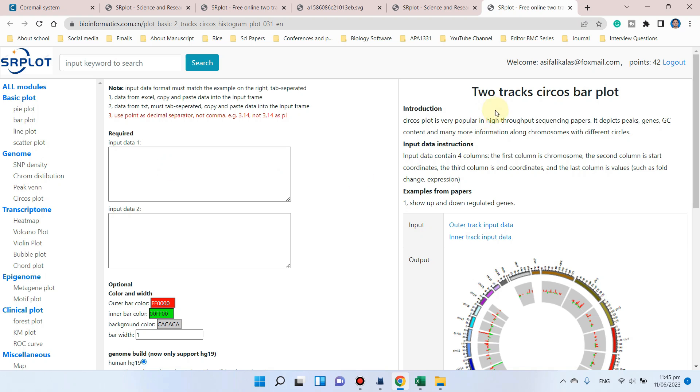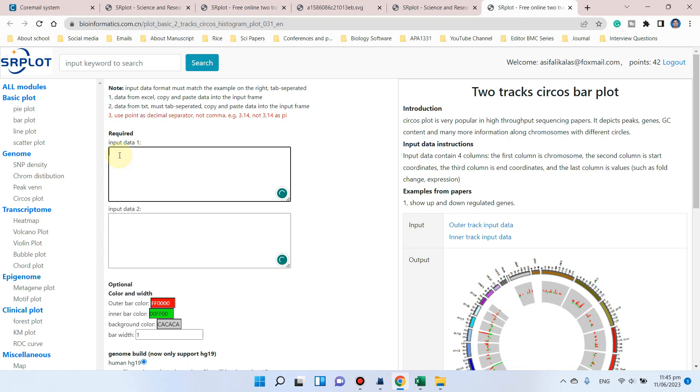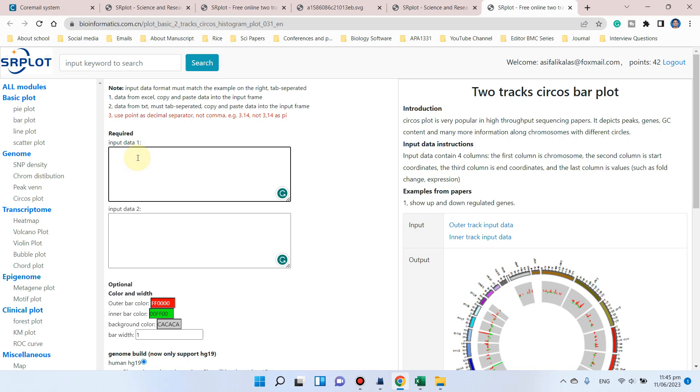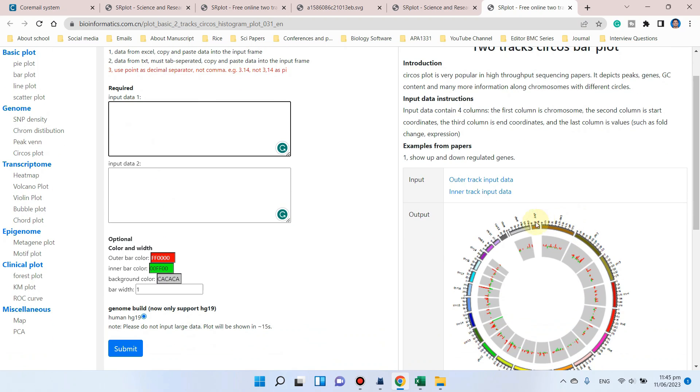Where you can draw two-track circle plots. Here you can see it requires two forms of inputs: data one and data two. In the first one, you can import the data of the outer track. Like here, we have the outer track in the circle plot, and similarly in data two, you can input the data of the inner track.